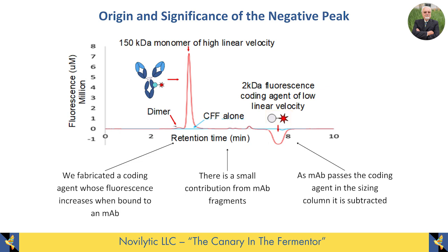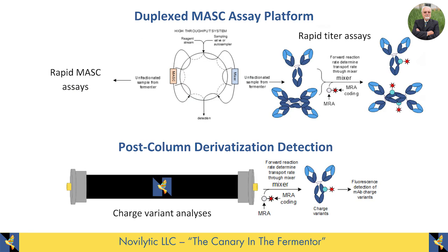So there's an amplification of the fluorescence, and that amplification increases the sensitivity. It has another meaning also: you can run things continuously and don't have to do the separation, just get the amplification of fluorescence.